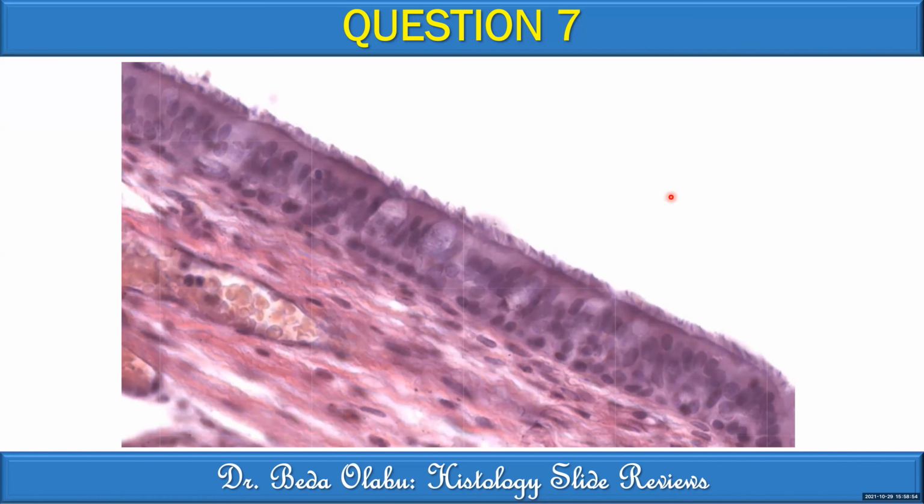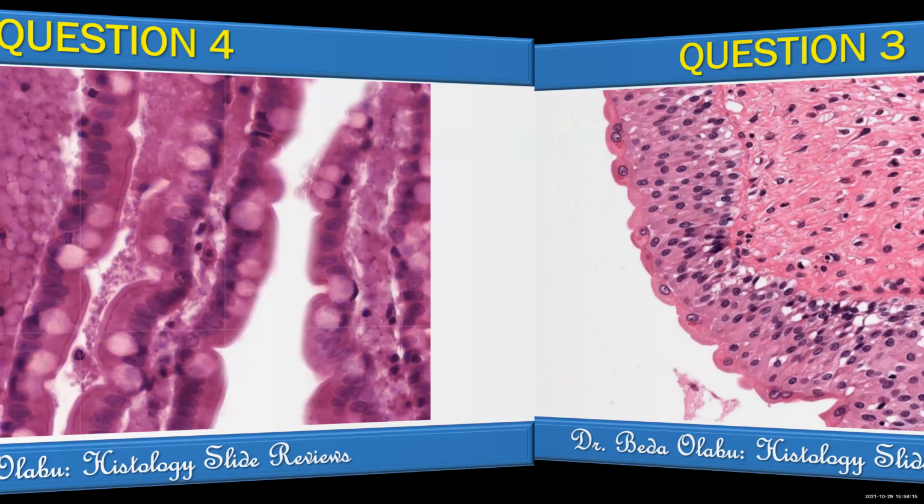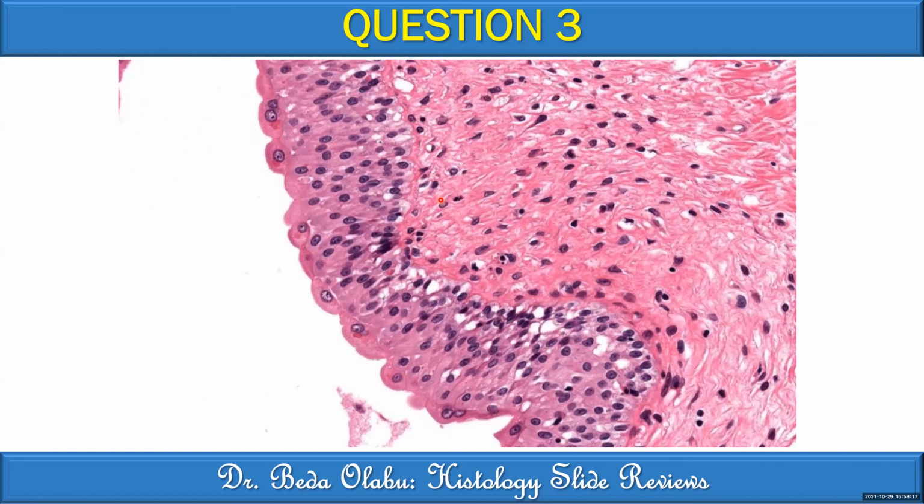Dorothy, do you have a question, or was it on the previous question as well? I have a question. Sorry, my internet is lagging, so I'm not able to keep up. I had a question on number 3 and 6. For instance, I felt like number 3 could have been pseudostratified the same as 6, but 6 was actually put to the urothelia. Sorry to ask this, but I want to tell the difference. Okay, so we are on number 3 here.